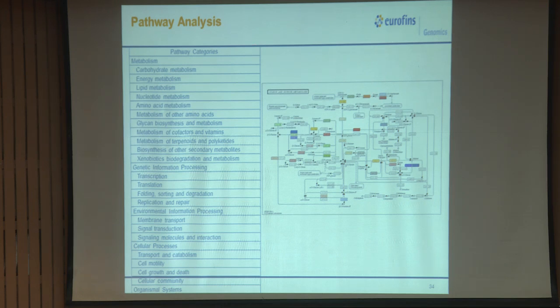all this. So, each and every gene and the pathway it falls in, that information can be found, including those basic pathways like glycolysis, Krebs cycle and all. All those genes can be identified using the KEGG database, and the pathways look like this. Wherever you have mapping you can see different colors, where you do not have it you might be seeing white. You can play around with these databases.